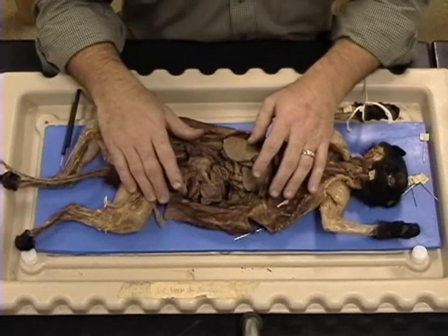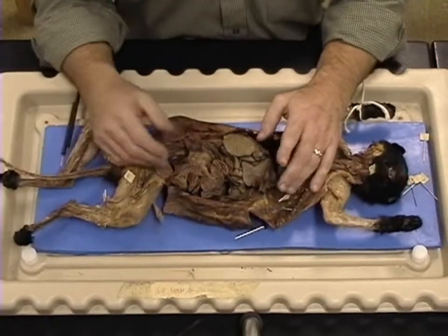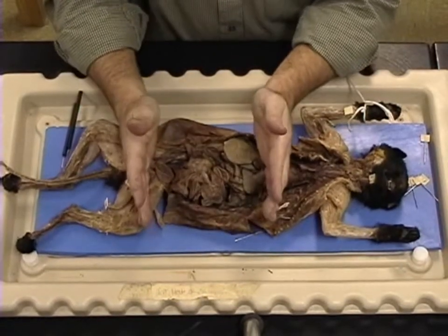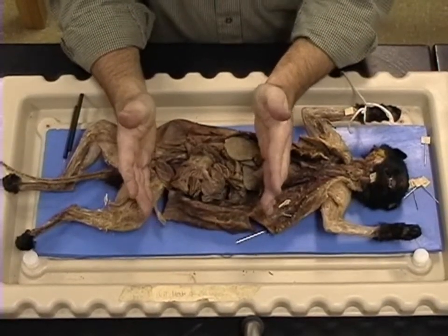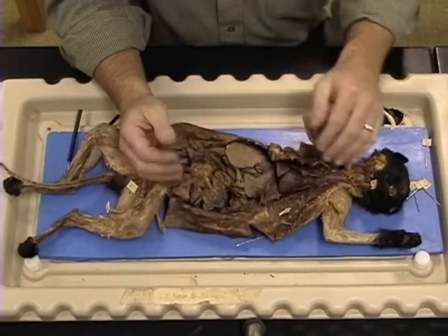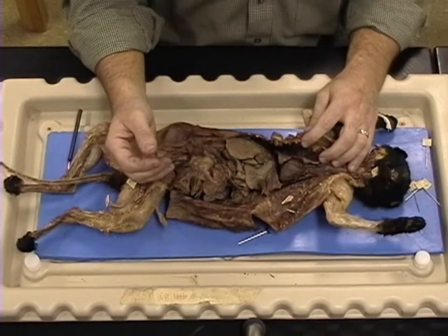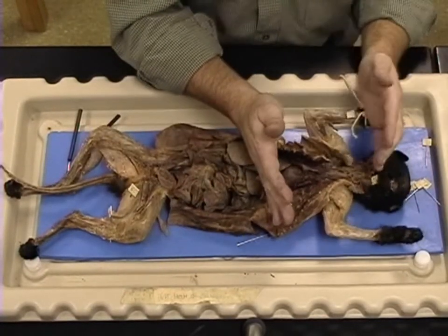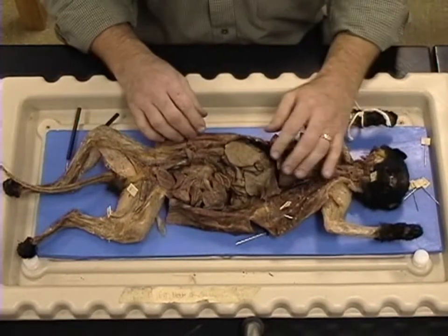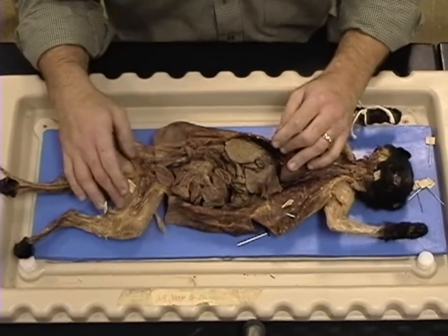Now in this portion of the cat, we're going to examine several things. First of all, we're going to take a look at the abdominal cavity of the cat, which comprises this portion right here. It's from the liver down to about the bladder. Next, we'll take a look at the thoracic cavity of the cat, which is from the diaphragm up here to the esophagus and trachea. So, first of all, let's take a look at the abdominal cavity.